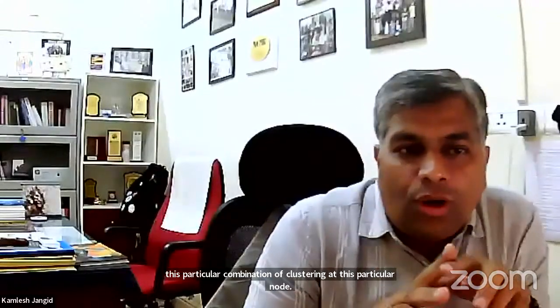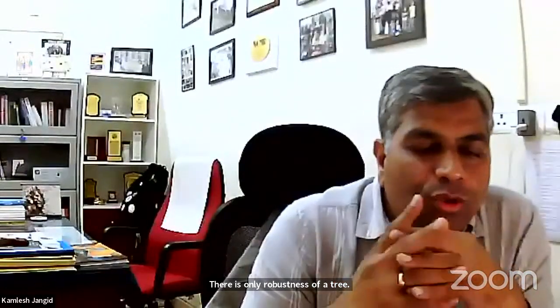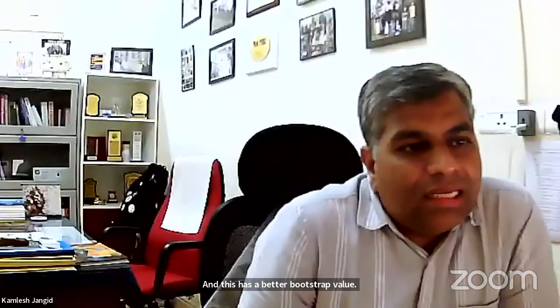So for that reason, there is no acceptability or deniability of the tree. There is only robustness of a tree. So if you feel that there is no more accurate noding or clustering pattern compared to this one, and this has a better bootstrap value, this is your robust tree. Okay, so that is how I take it.